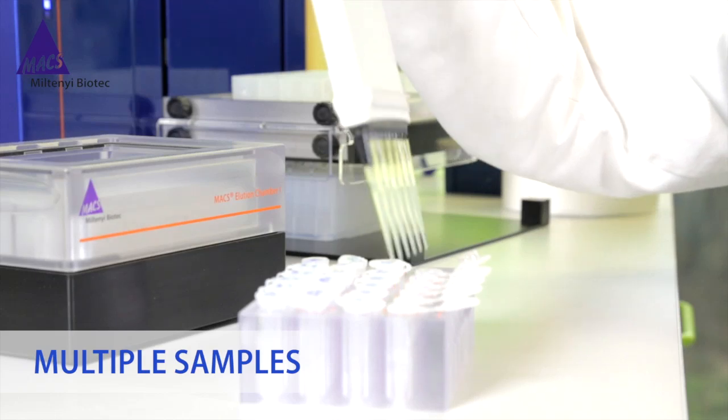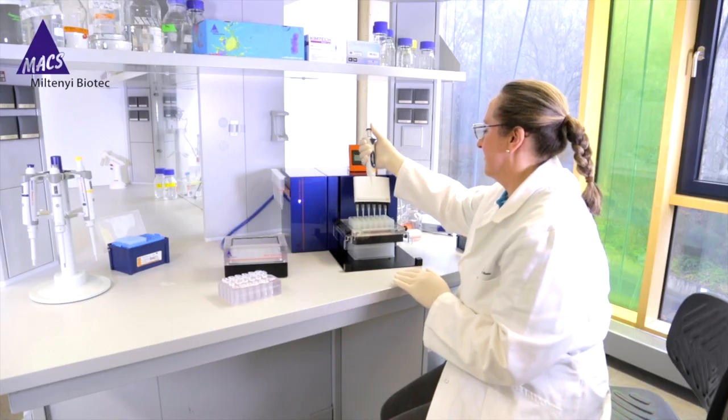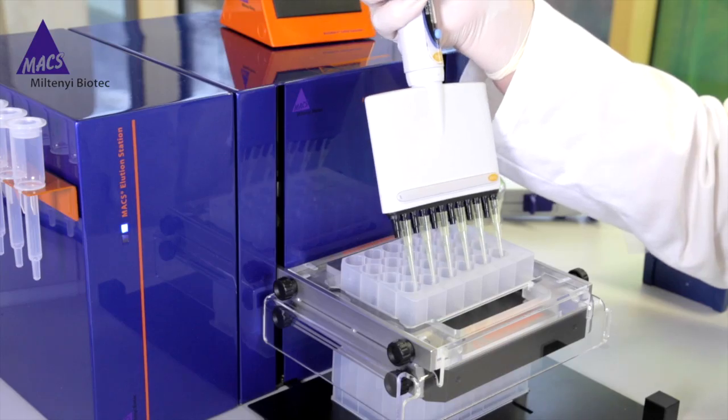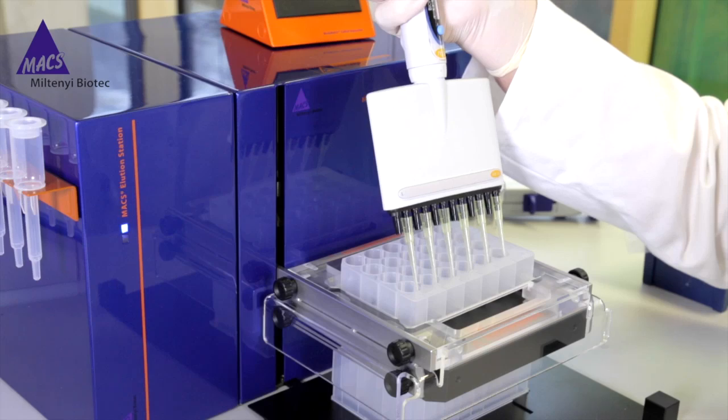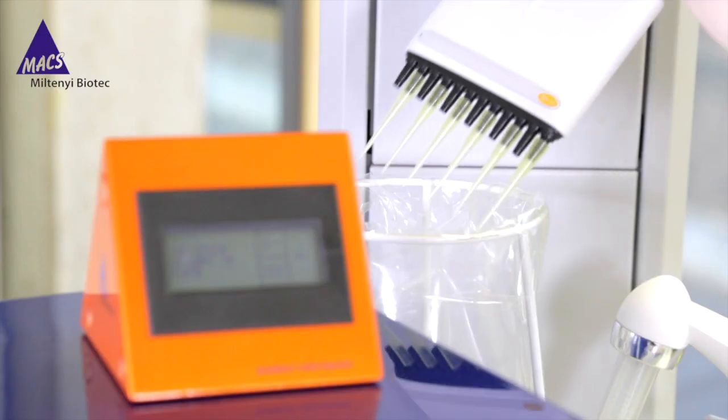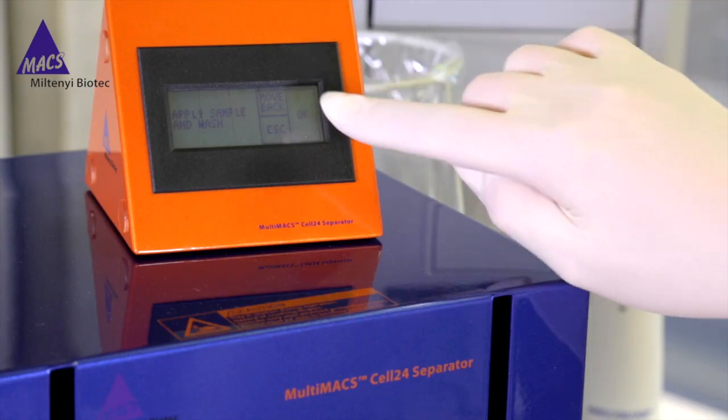Whereas the Multi-24 column block allows you to isolate up to 24 samples or 90 milliliters of whole blood in a single run, saving you considerable time, money, and effort.